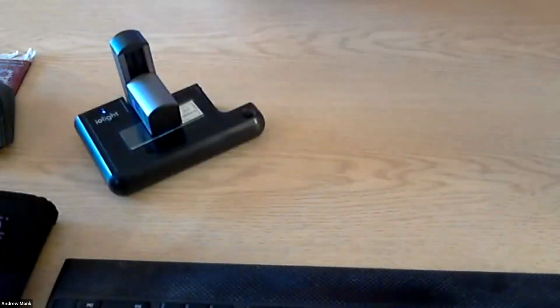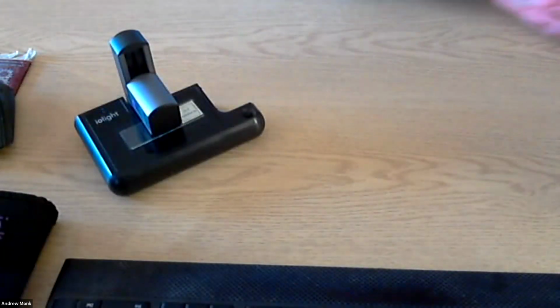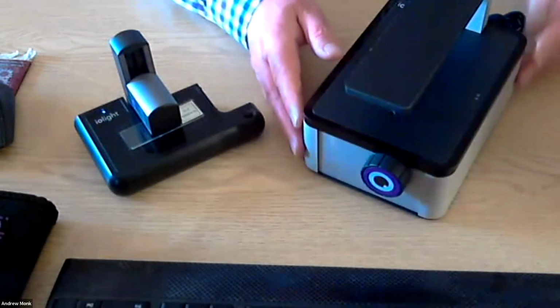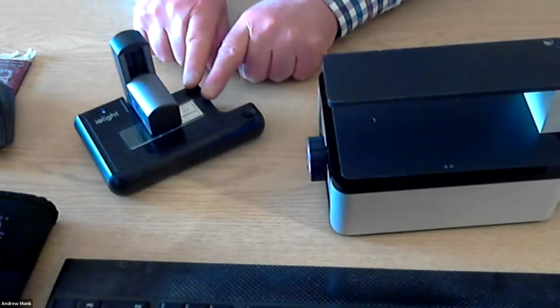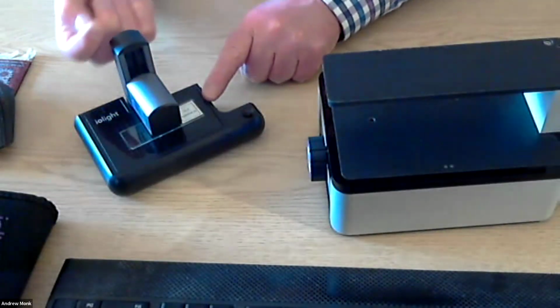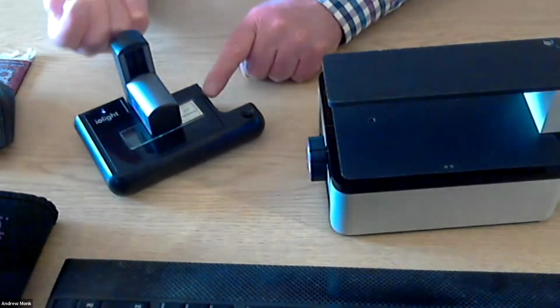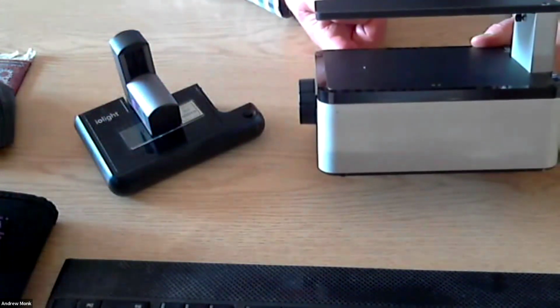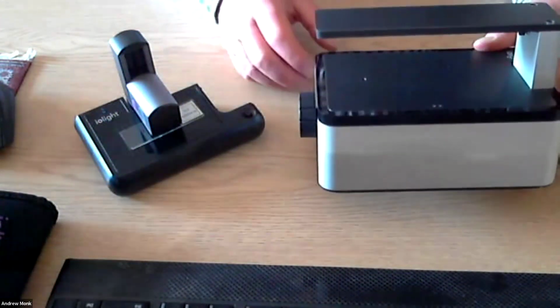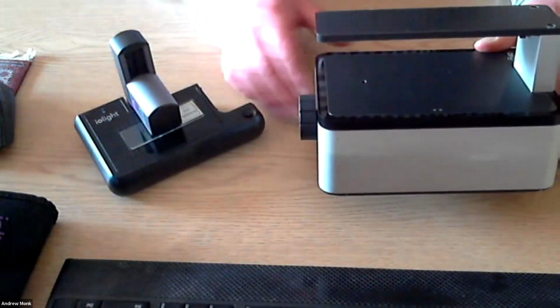I was going to ask if you had your inverted cell imager also. You wanted to show us the size of that one, or are you saving that for the grand finale? No, we can have a look at that. So while we're down here, the cell imager: this microscope, the portable one, the camera is at the top and the illuminator is underneath, and we're shining light through the sample into the camera. This one is inverted. So the camera is in the body, it's upside down, and the illuminator is at the top. So we've got more space, so we can do more sophisticated things.